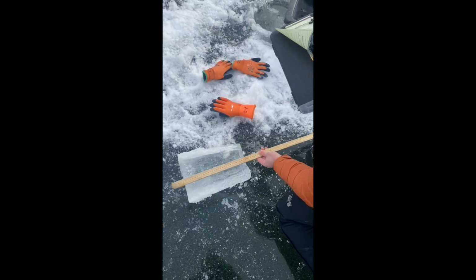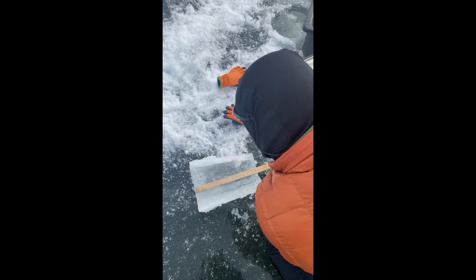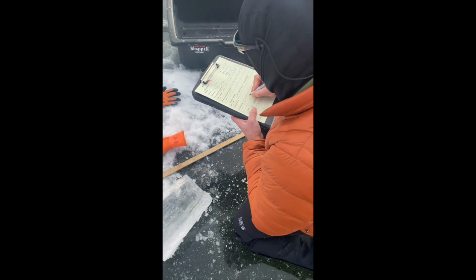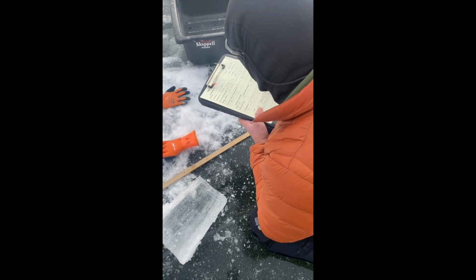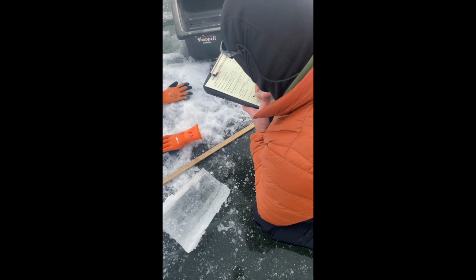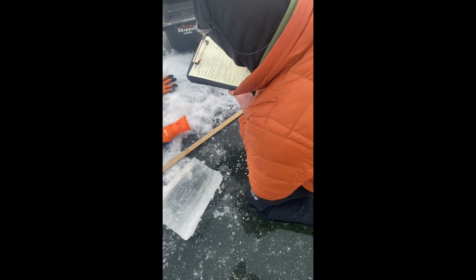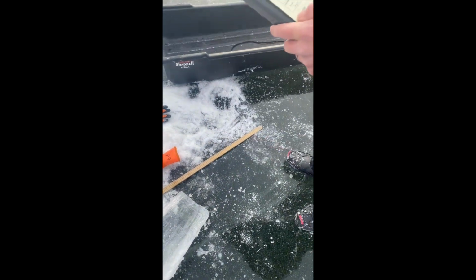And this layer is about 24 centimeters down. So at 24 centimeter depth, greenish layer, approximately 2 centimeters thick. Yeah, something like this.